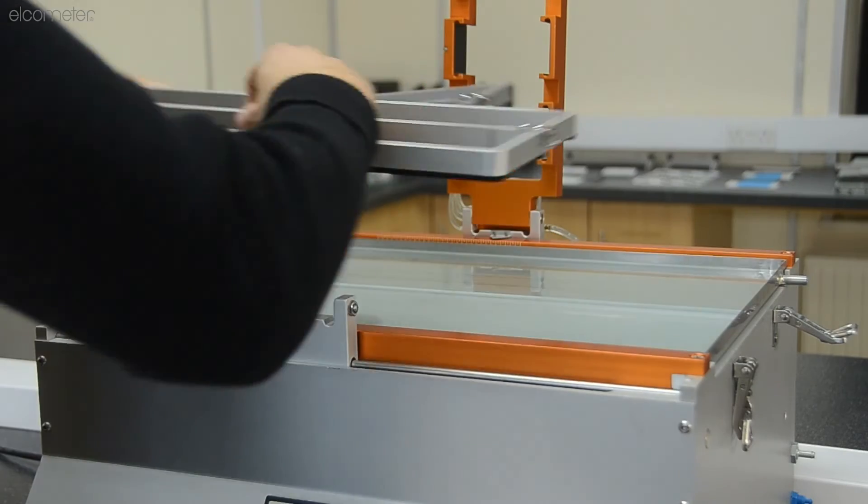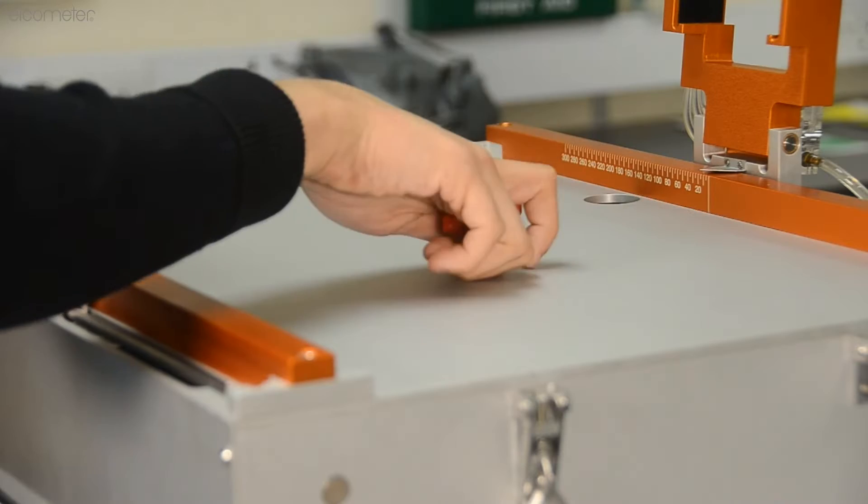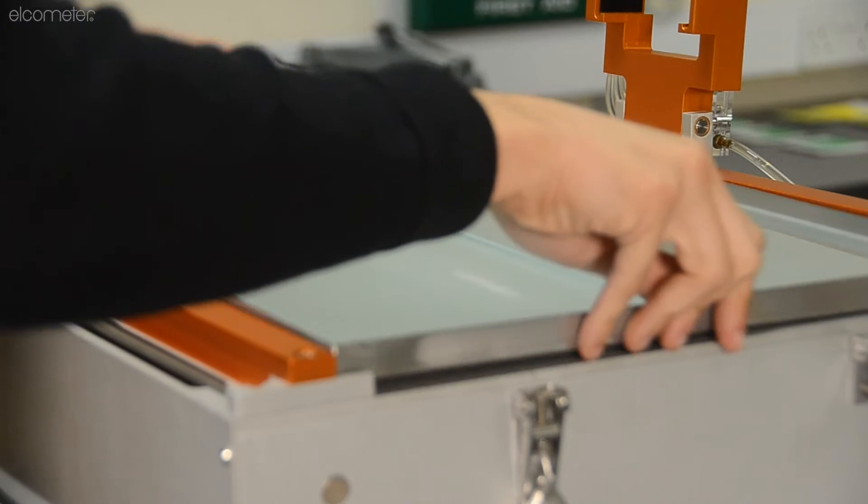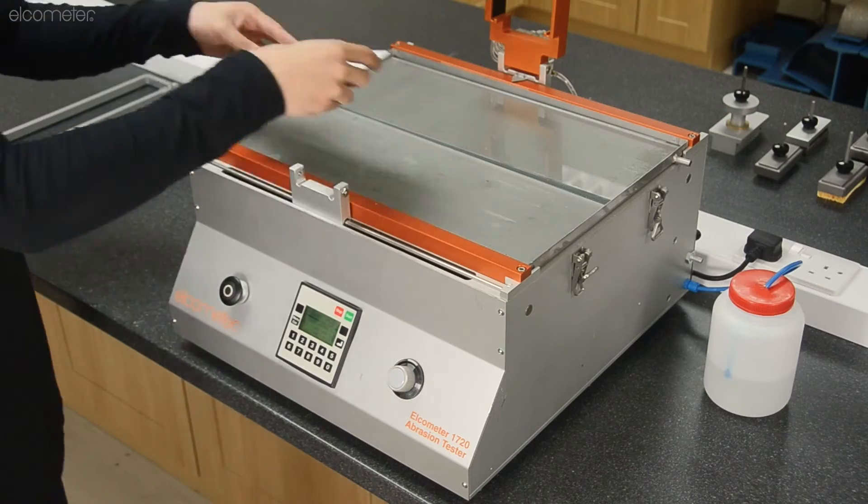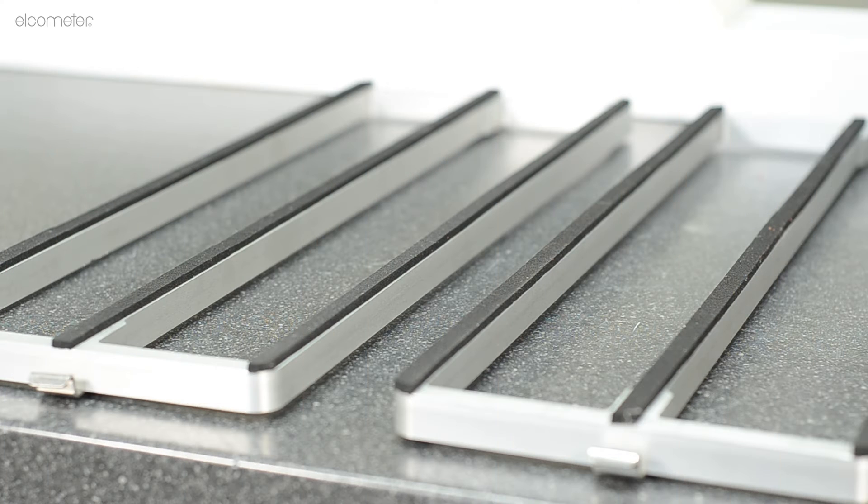To conduct a washability test using the Elcometer 1720, simply lift up the carriage to remove the tray. Then, use the provided tools to adjust the stroke length to your desired length. Place the tray back onto the tester and insert the materials being tested into the tray. Secure them tightly with the provided gasket frames.